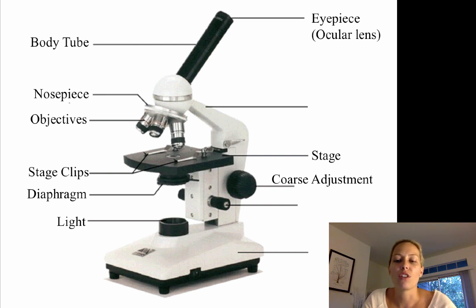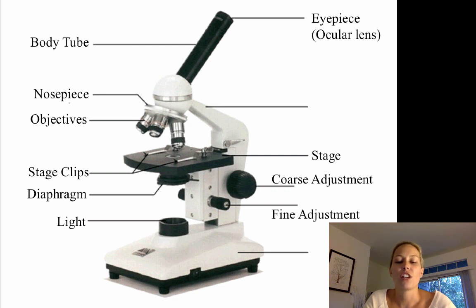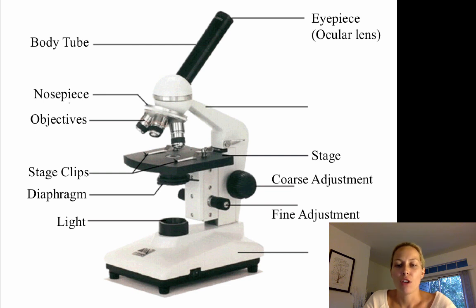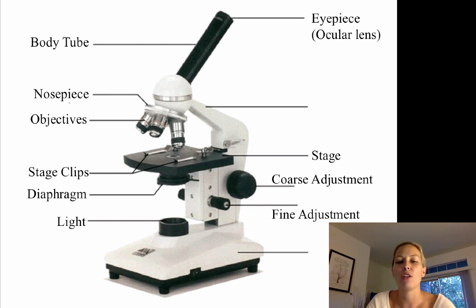Next we have the coarse adjustment knob, the largest knob on the microscope. It is responsible for moving the stage up and down and is used to focus your specimen. The fine adjustment knob, the smallest knob, is responsible for sharpening the image — if the edges seem a little fuzzy, you use it to fine-tune your image so that it is sharp and clear.